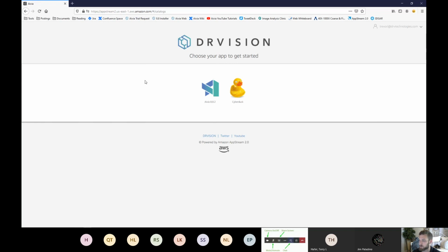I'm also sharing my screen of what this process of logging in looks like. Obviously, whenever I log in, I'm going to click the Aivia logo, and it says it takes 2 minutes. It probably will only take 1 minute to fully open, maybe 40 seconds even.